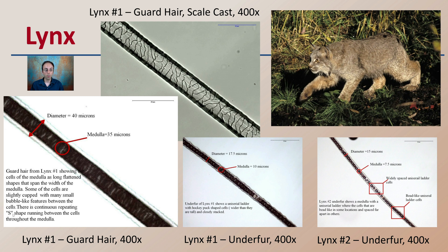There is a continuous repeating S-shaped pattern running between the cells throughout the medulla. All the images on this slide are from the lynx. We have the guard scale cast, which is a casting of the actual cuticle region, the guard hair, the underfur, and a different area of the underfur — and we can see there are some differences. It's important to keep that in mind when making matches or classifications of hair that might be found.